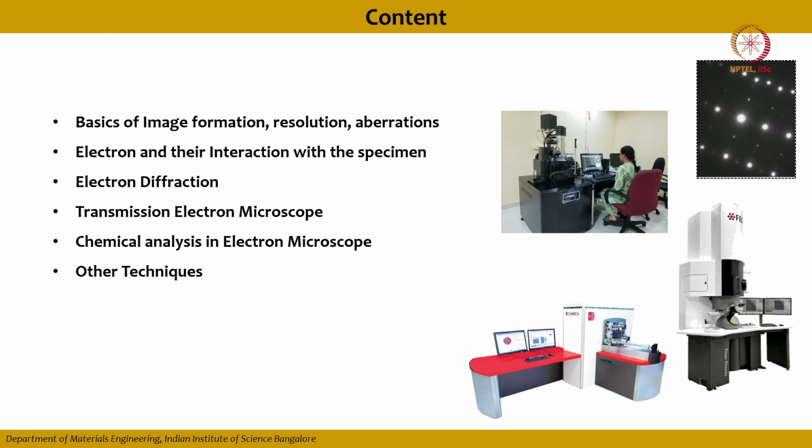What will the content be? The basics. I will cover the basics of image formation, resolution, aberrations. Okay, these are very important to understand image formation in the transmission electron microscope. Then we will briefly go through the electron interaction with the sample surface, and what are the signals which we get in a typical microscope, be it in transmission mode or in scanning mode.